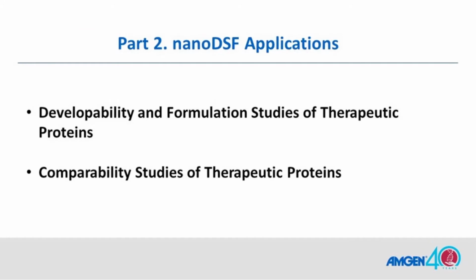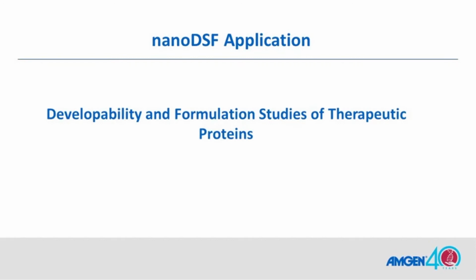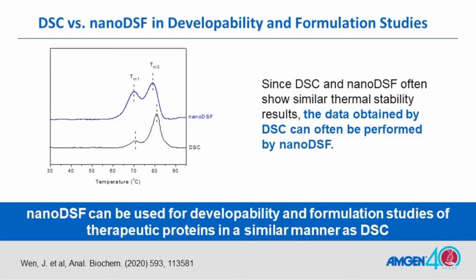Now let's switch gears and talk about part 2, nanoDSF applications. The first one is developability and formulation study. The second one is comparability study. Now let's take a look at the first one, developability and formulation study of therapeutic proteins.